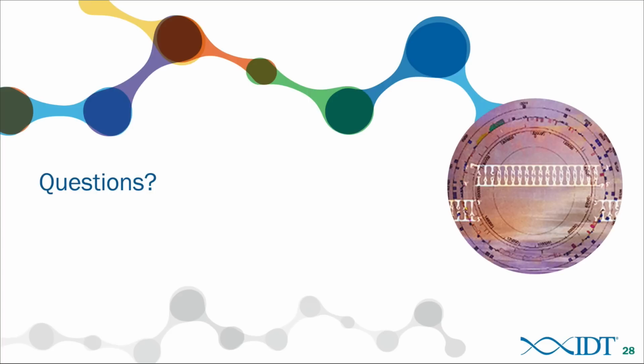As you might imagine, you're transfecting in a DNA template, which could be incorporated into the site of a double-strand break by the non-homologous end-joining pathway, if the template is still hanging around. We definitely see that when we use the G-blocks, and we do not in the case of the Alt-R CRISPR products.